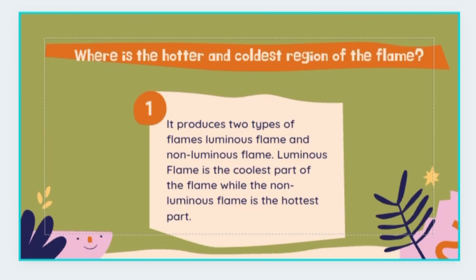So, where are the hottest and coldest regions of the flame? It produces two types of flame, luminous flame and non-luminous flame. Luminous flame is the coldest part of the flame, while the non-luminous flame is the hottest part.